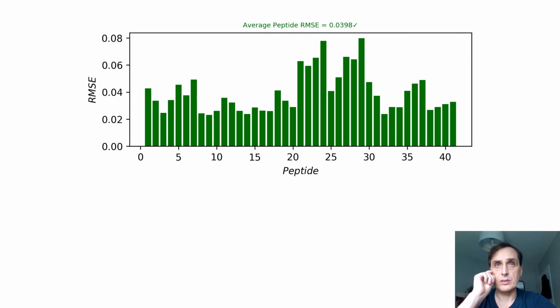Another tool that can aid in the creation of subsections, or another metric that's reported by HDXmodeller, is the peptide error. And HDXmodeller will produce an image like this after every optimization which reports the peptide error.